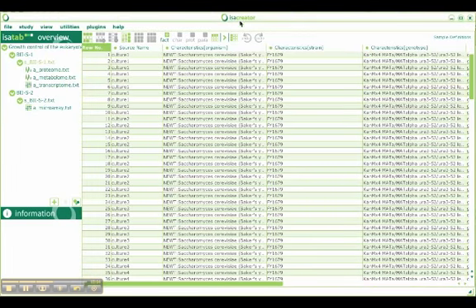A number of buttons are important to notice here. We just already showed you the transpose view. We've got this undo redo button. If you made a mistake, you can still go back. You've got the ability to add factors or to add characteristics and protocol.